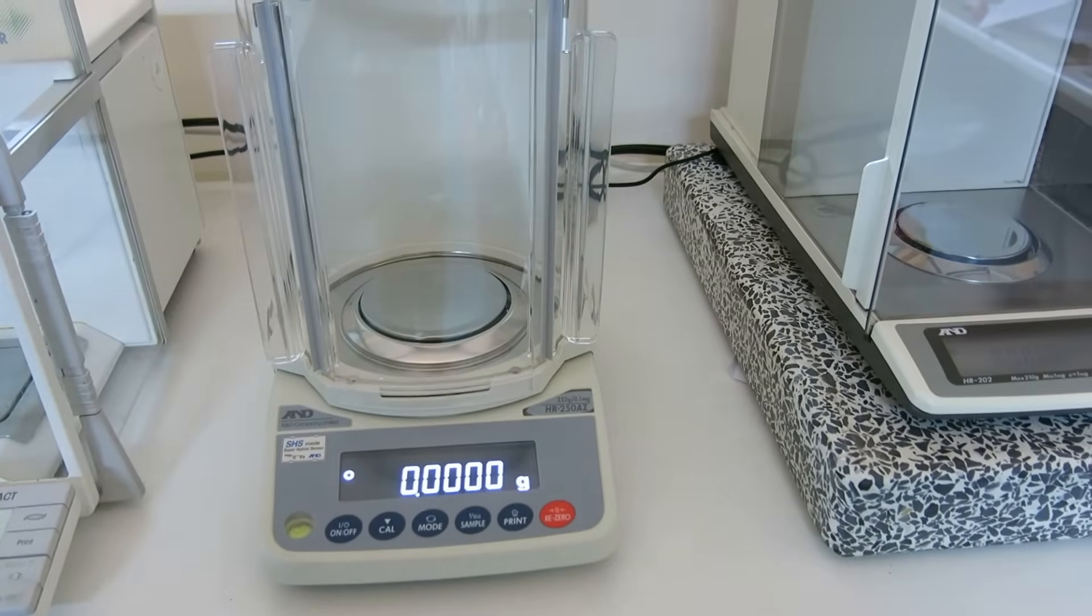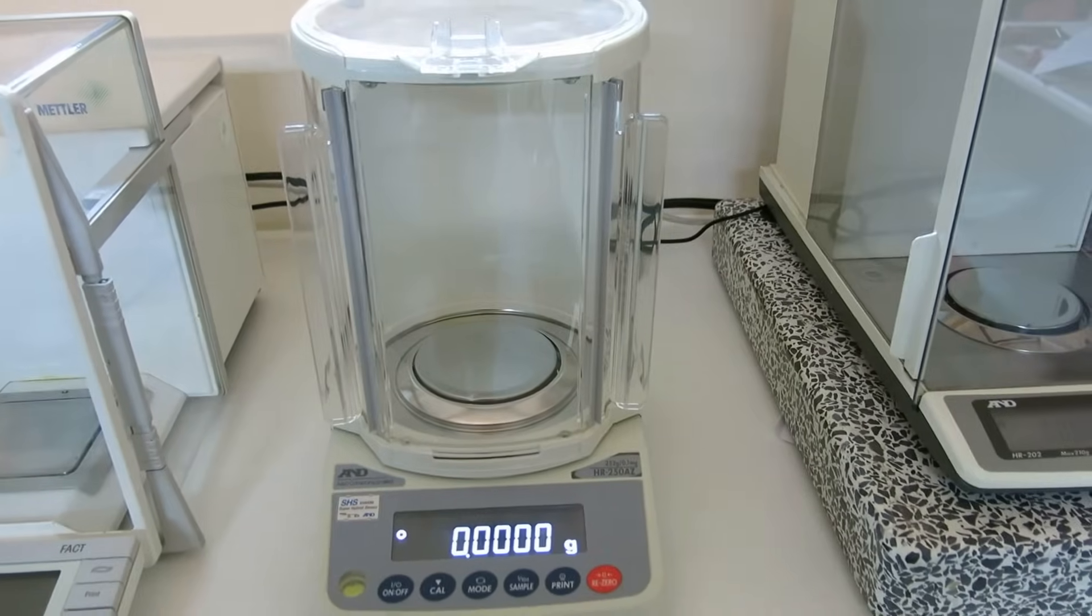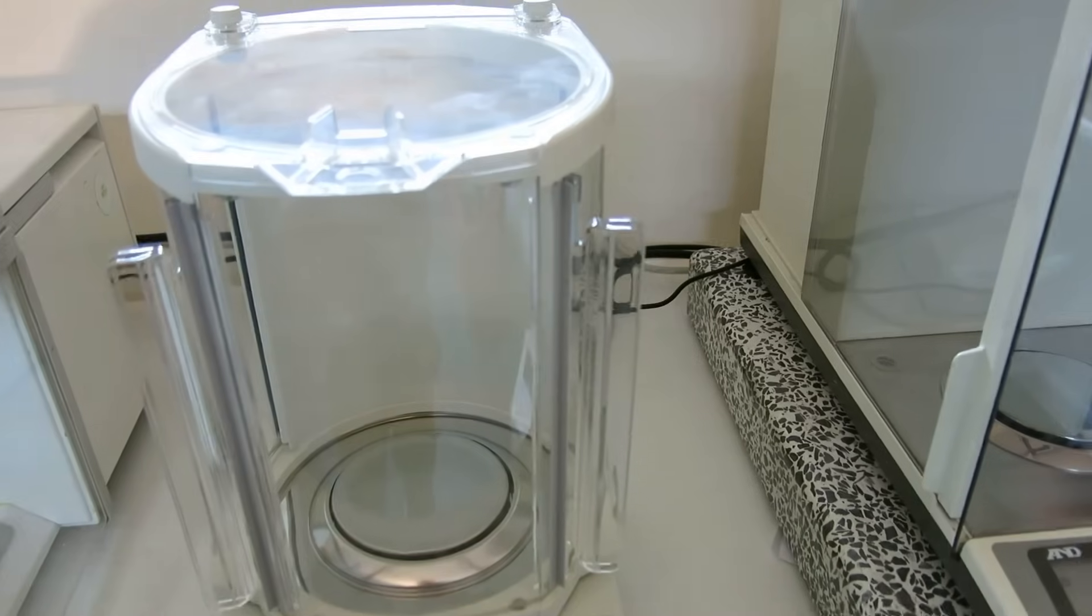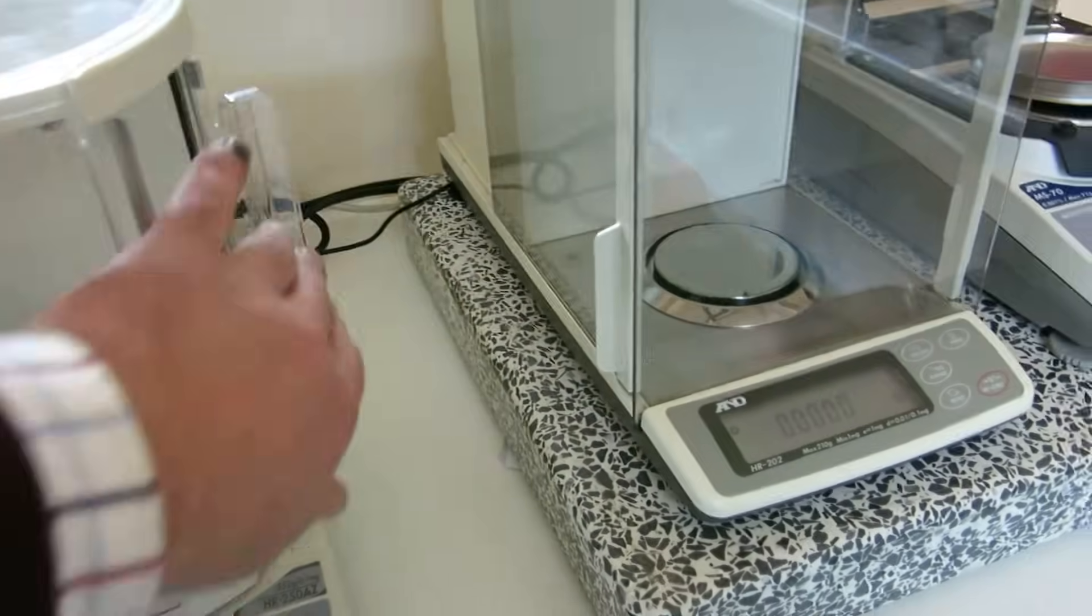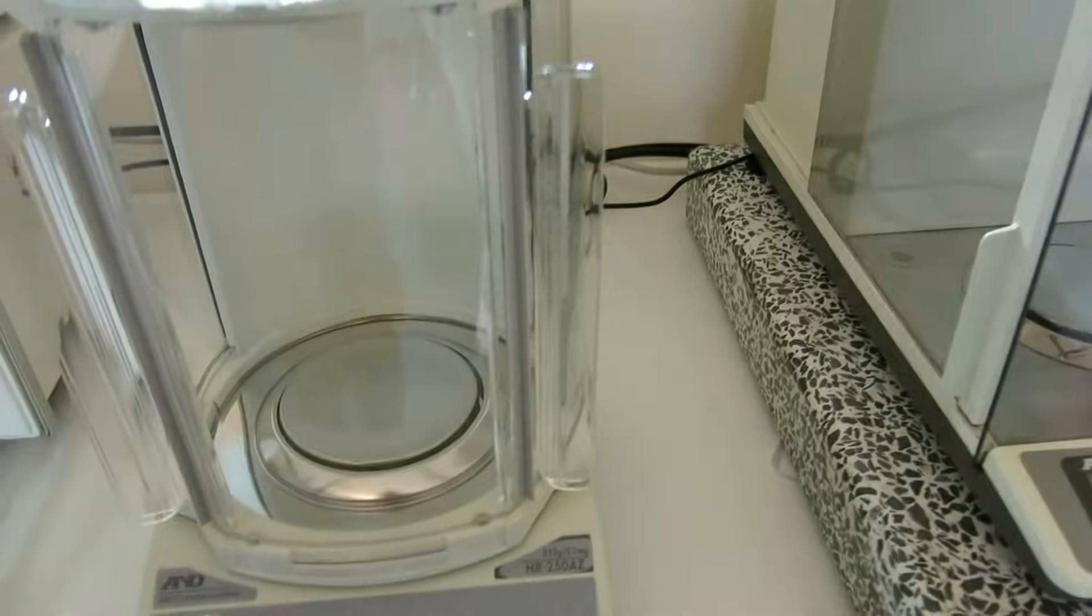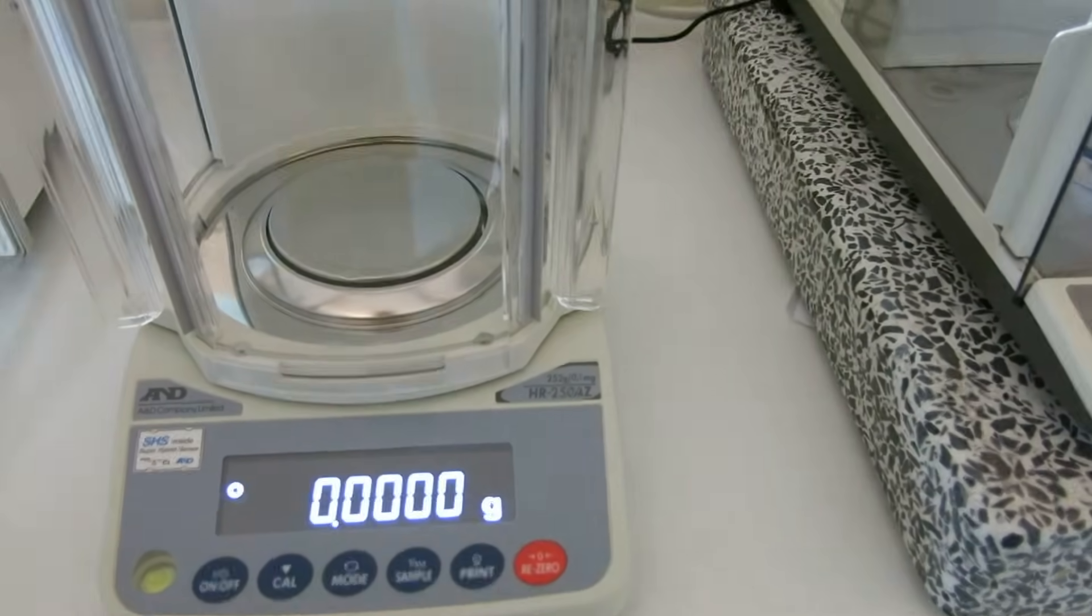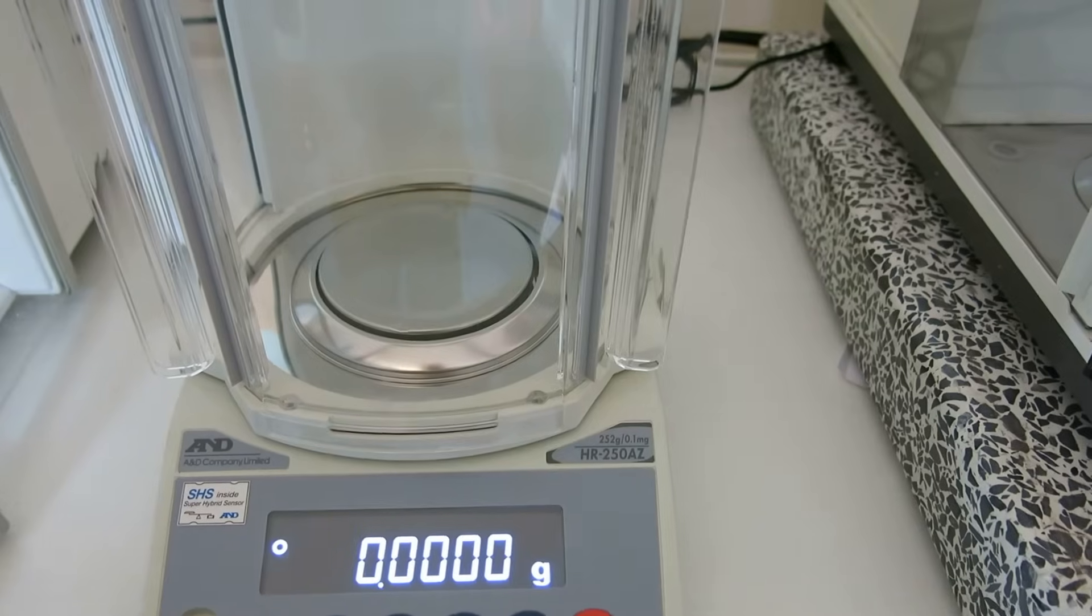We've then got the HR250AZ, which is a new balance. An A&D. It's a really lovely balance. One of my favourites this. It's a very, very robust balance. The beauty with it is it will sit on an A4 piece of paper. It comes with a long warranty. It's got a super hybrid sensor. So it will stabilize in less than a second, which is good news if you're doing a lot of quick weighing or successive weighing rather.